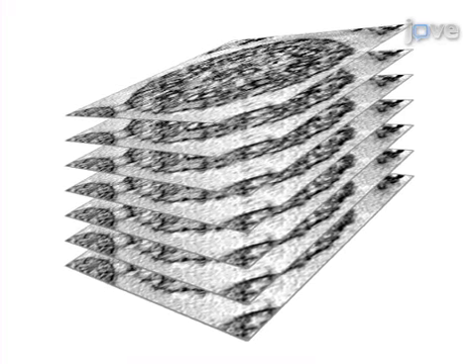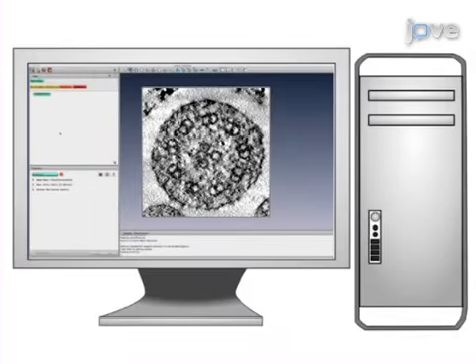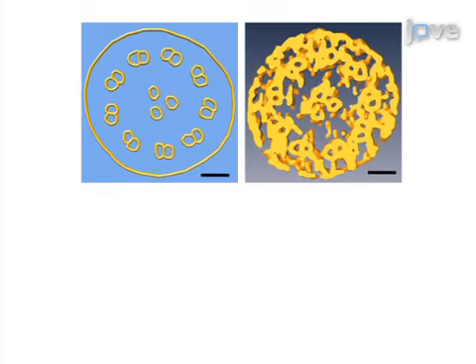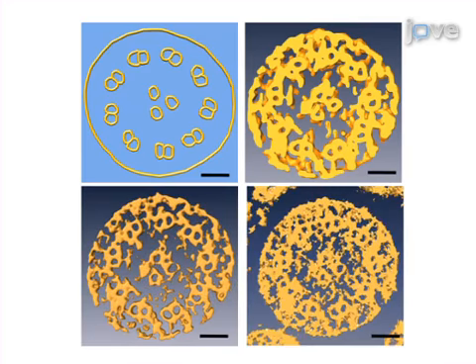As a second step, the data's objective and subjective characteristics are assessed to inform the best choice of method for segmentation. Next, either manual abstracted model generation, manual tracing of features of interest, automated density-based segmentation, or custom-tailored automated segmentation are performed to extract the features of interest.